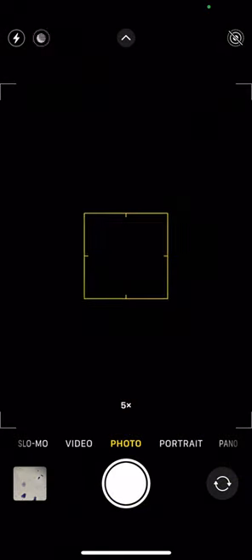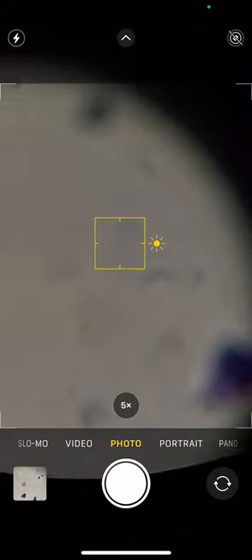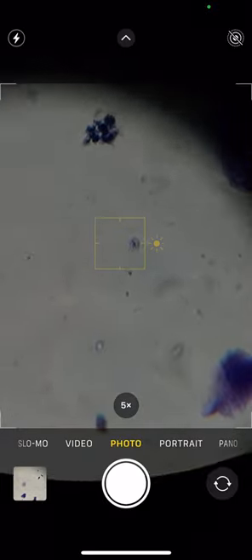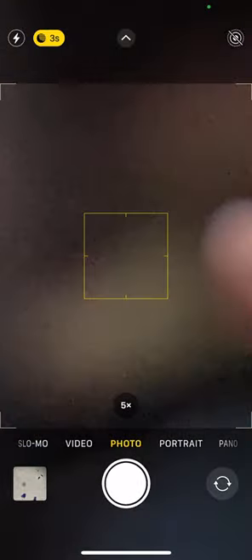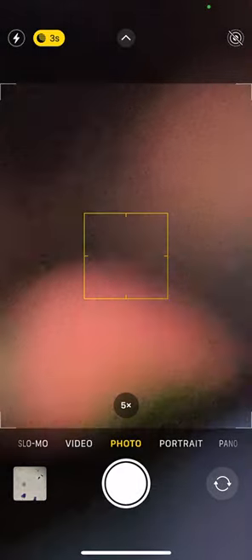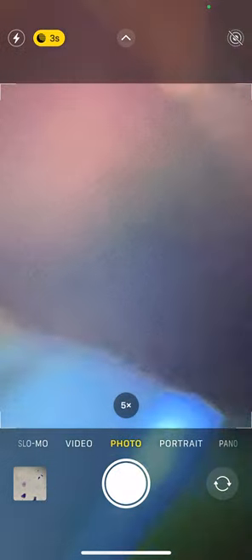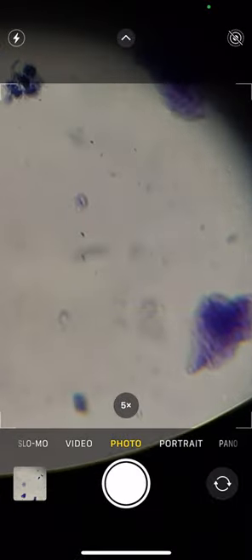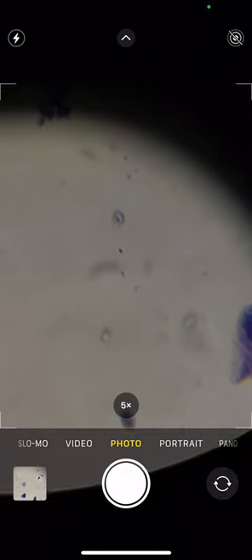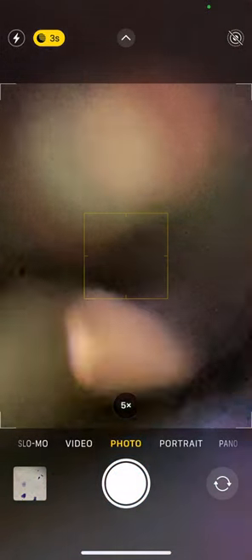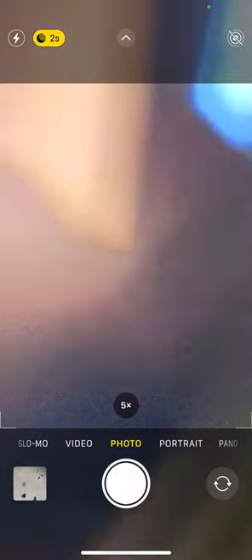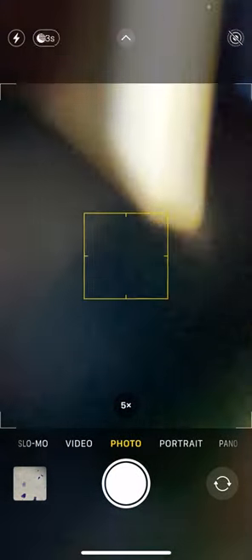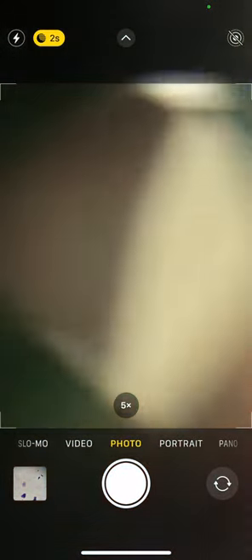Let's see if we can catch that one on high power. This may be where it gets a little tricky. Trying to find it on high power. I know I'm not exactly centered. My phone camera isn't exactly centered. I lost the view. There we go. Might just have to deal with whatever I can get.